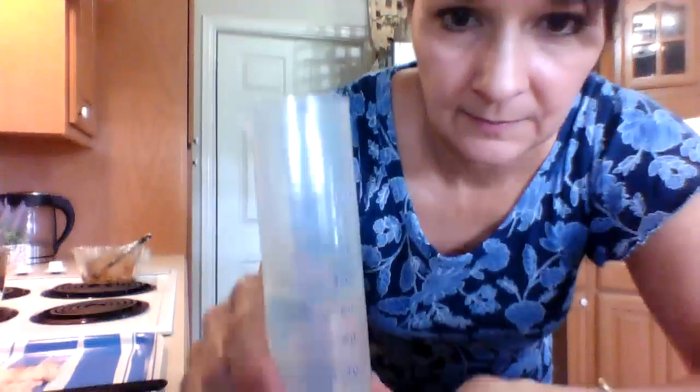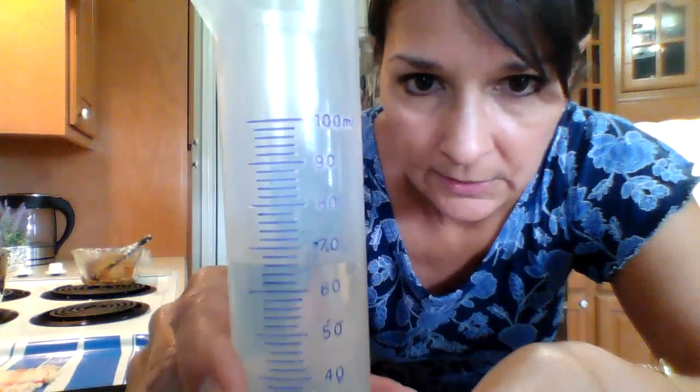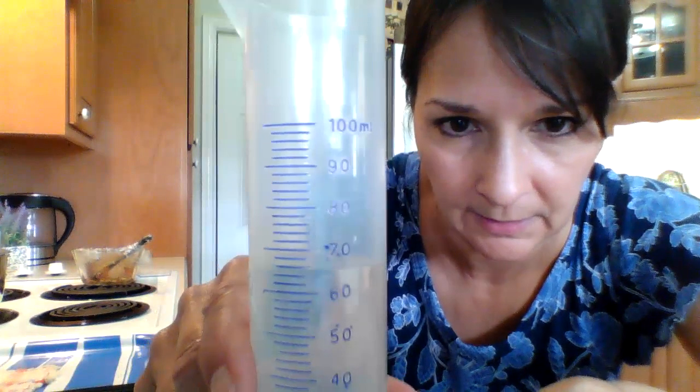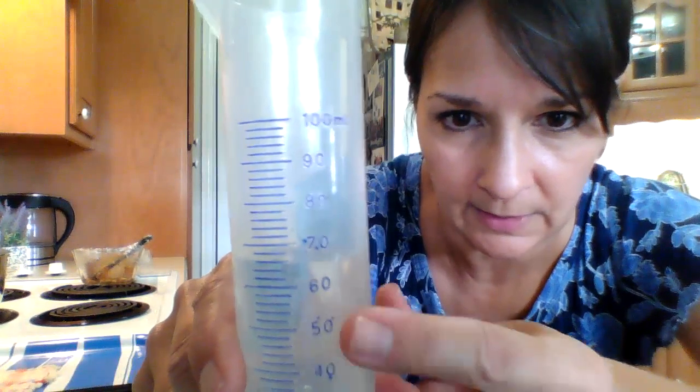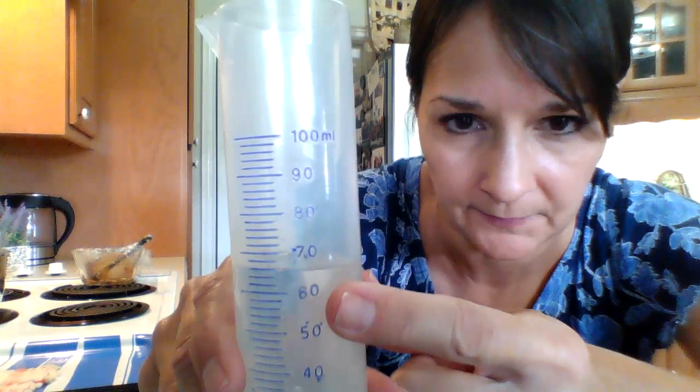Okay, I have some water here. I'm going to pour some into the graduated cylinder. Oops, you can't see that. And let's see what we have. Now it's real important that you get eye level with the top of the water. And notice here that it's up beyond 60. I can hold it straight.